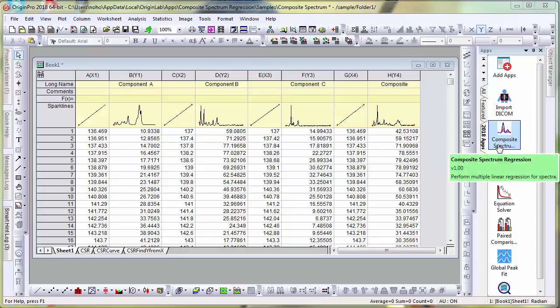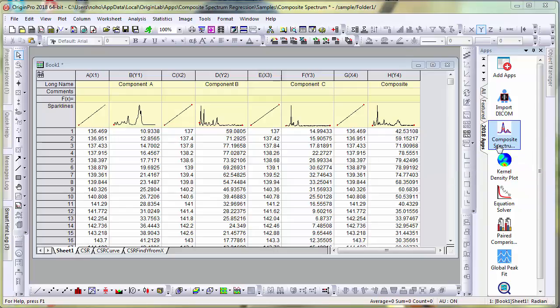In this video, we'll take a look at the Composite Spectrum Regression app introduced in version 2018.